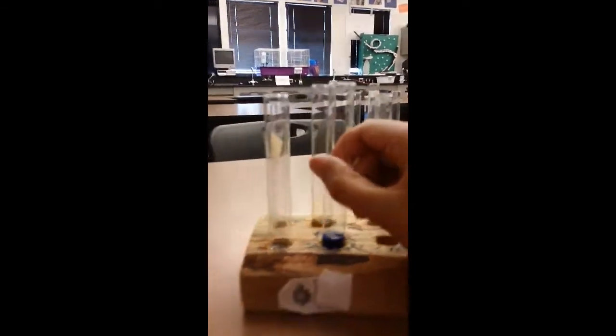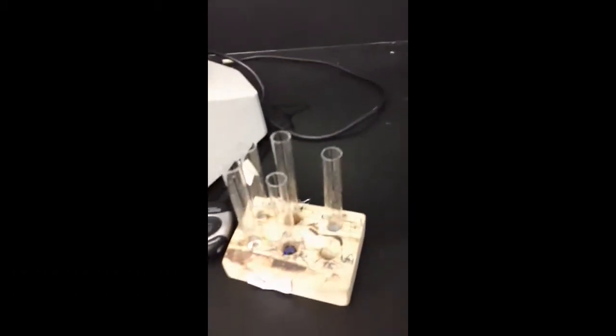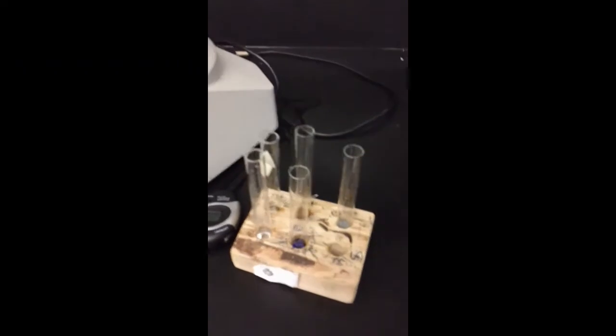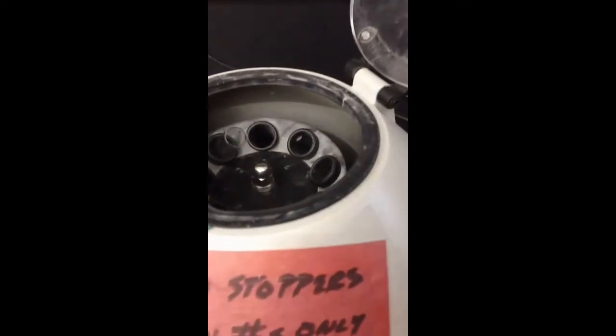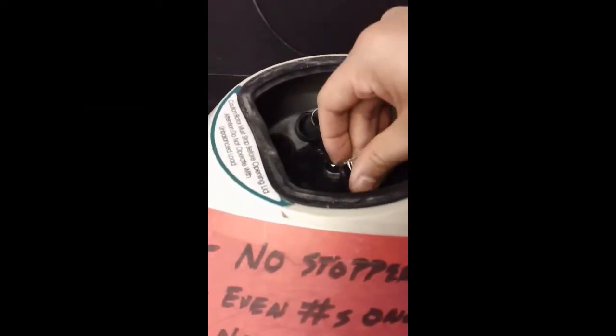Okay, my next step will be to centrifuge. So I'm going to go over to my centrifuge. I'm going to make sure that I don't have my stoppers in at the centrifuge. When I centrifuge, I want to make sure I have no more than 6 test tubes, but that I'm balanced. So what I'm going to need to do is 4 the first time so that it's balanced. So I'm making sure I know what's what. So I have my zinc, and I might just do 2.